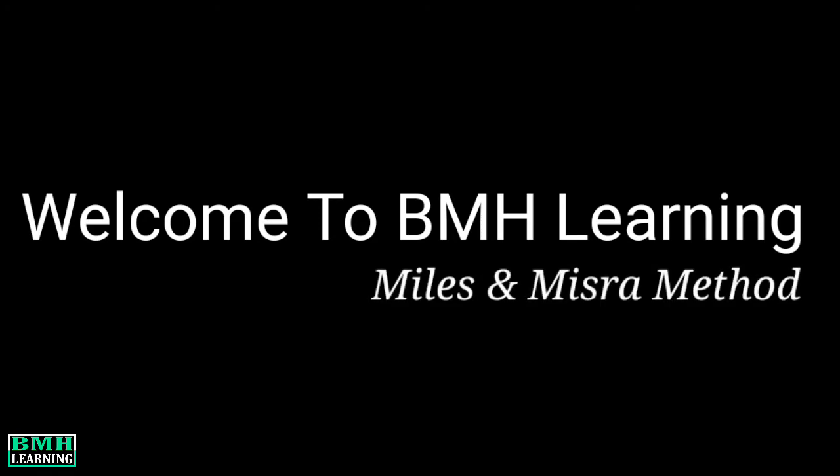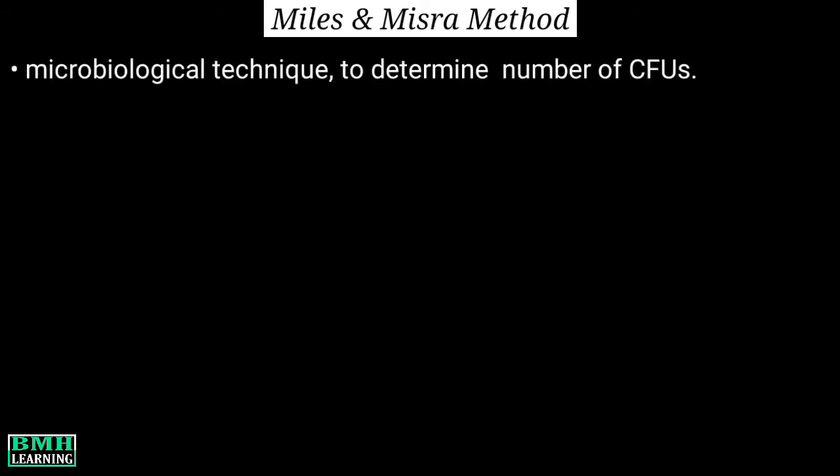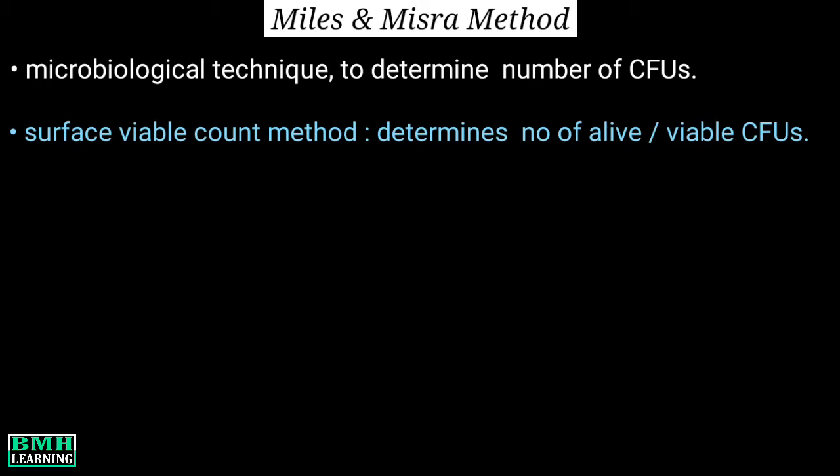This video is about the Miles and Misra method. The Miles and Misra method is a microbiological technique used to determine the number of colony forming units, or you can say CFUs, in a bacterial suspension. Unlike other cell count techniques, the Miles and Misra method is actually a surface viable count method. That is, it determines the number of alive or viable colony forming units.